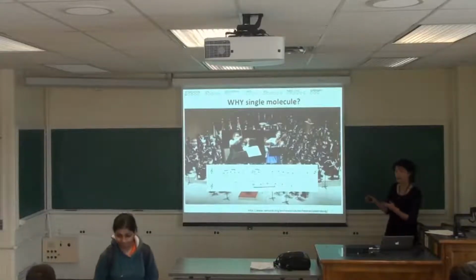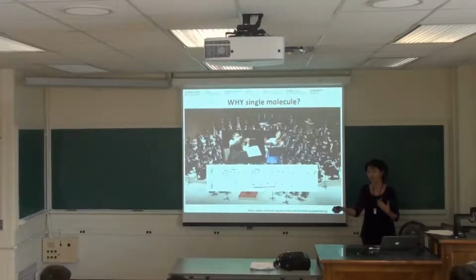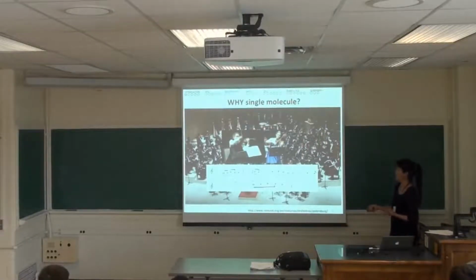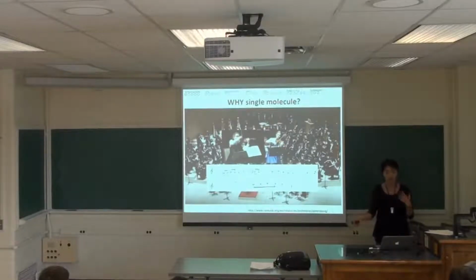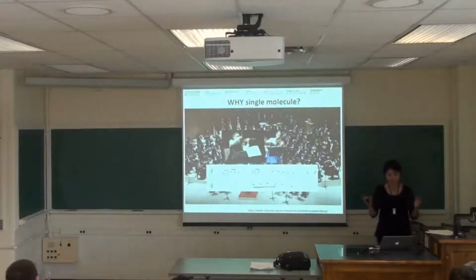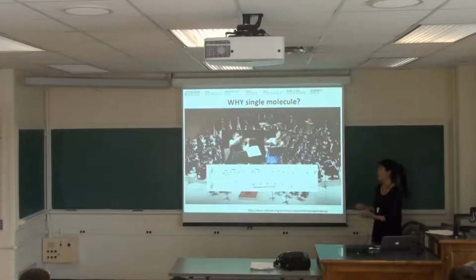And you can learn about the role that they play in this music, the role that they contribute to this music. So he enters first in this case, and then she enters a little bit later. He goes into this crescendo mode, and she enters in this dolce mode. So there's this dynamic, loud and soft, and there's an interdynamic between the two molecules, as well as their interactions that contributes to the entire music. So that's somewhat like our single molecule measurements. We look at molecules in isolation.